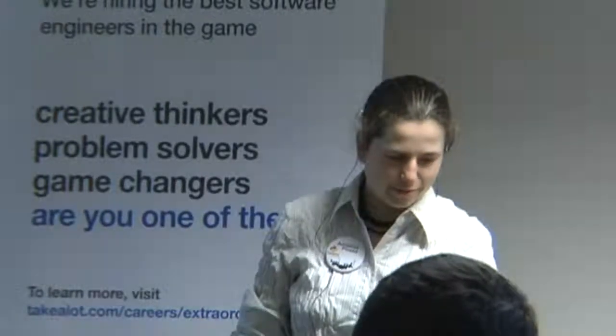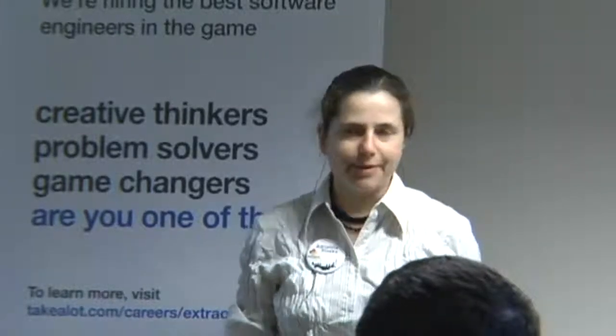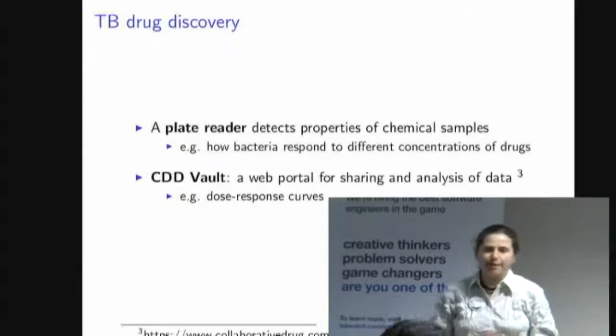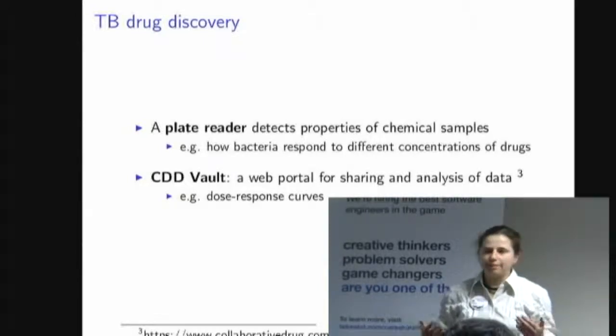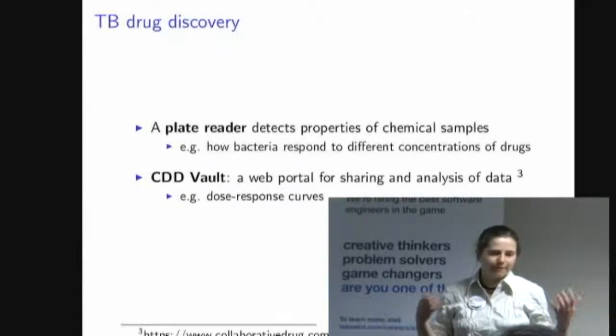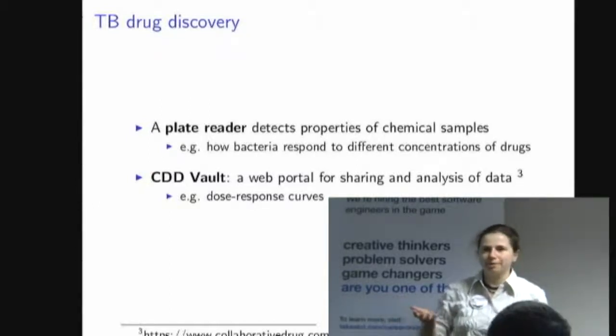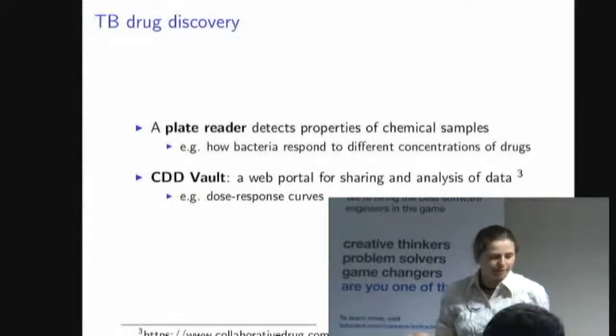So the first project that I was involved with at the eResearch Center was to automate some data that was being used in tuberculosis drug discovery. There's a particular research unit at the medical faculty where they use a plate reader to do assays of compounds that could potentially have properties used for TB drugs.